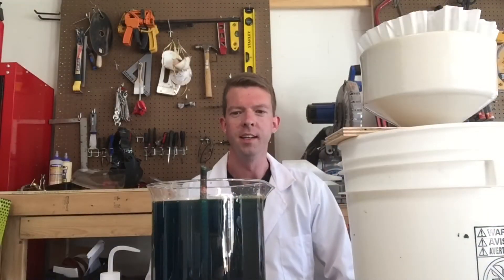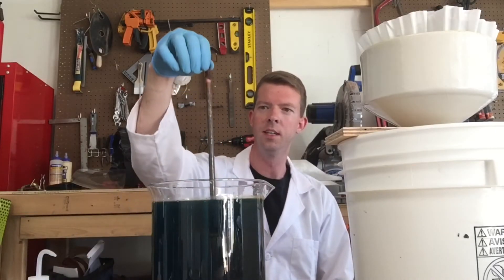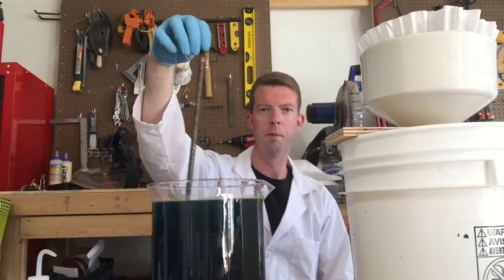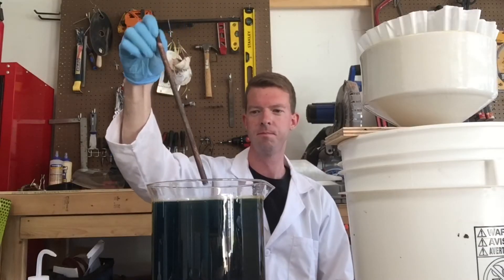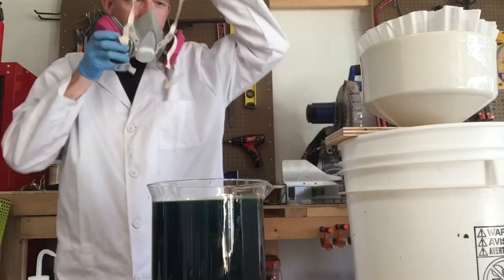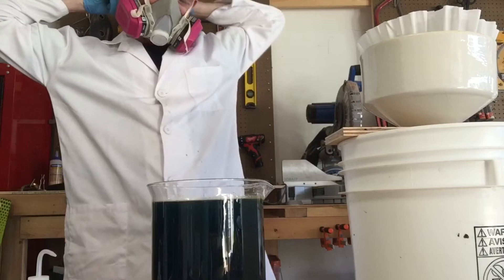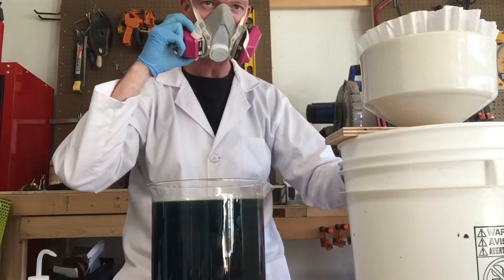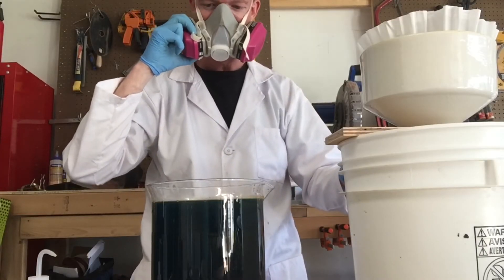We're back. The copper has been sitting for about three days. As you can see, our piece of steel here is just covered in copper and there's a whole lot of sediment on the bottom. We're going to see how much copper we actually retrieved out of this. I'm going to go ahead and dump this into my five-gallon waste bucket. I'm not going to be trying to get the iron out of it — it's really just a waste of time.